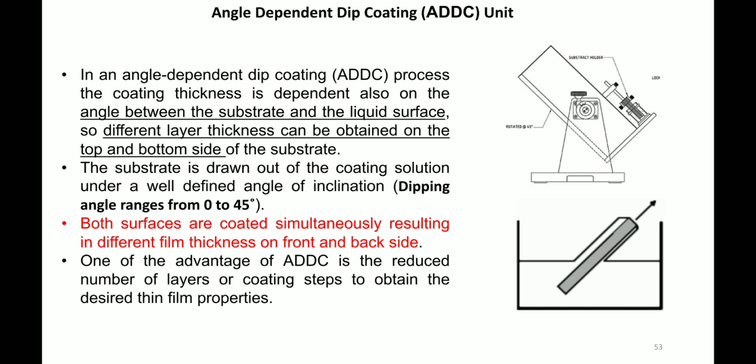So this is all about the three types of coating processes, where basically we are using a sol, which afterwards gets converted into a gel, and then we just dry it and get the desired film in the form of a coating. So we'll stop here, and we will see our next technique in the next lecture. Thank you.